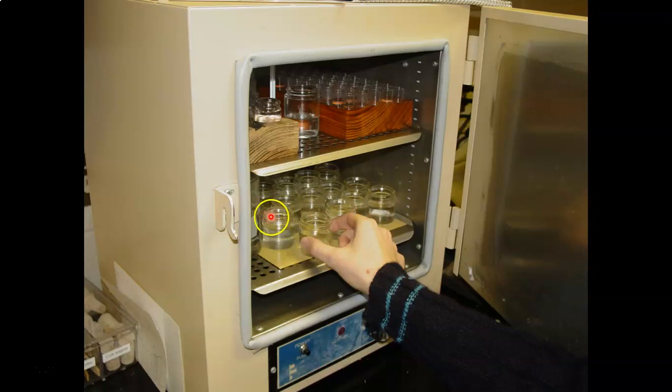Paraffin here is in a liquid form at 55 degrees. The wax will be in a liquid form and it will infiltrate the tissue and replace the xylene.